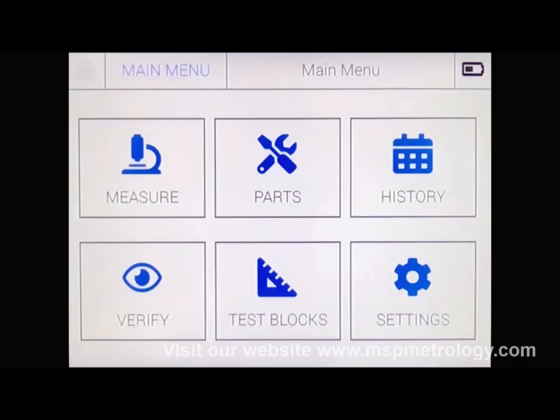We will begin with the main menu. When you start the KingScan 5 you will see the main menu, which is labeled at the top of the screen. The battery indicator is on the top right and shows the battery charge level. Below on the screen are icons highlighted in blue — blue means that it's a functionality you can access. On the main menu there are six icons to choose from, and today we will explore each of these.